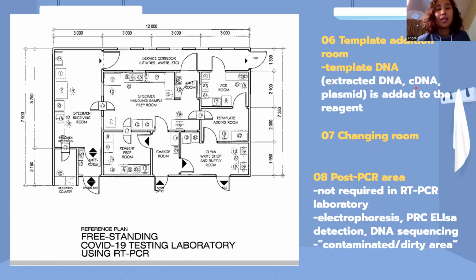Kunyari, guys, bear with me. Kung COVID-19, hindi ba RNA virus siya? I told you, your thermocycler, guys, does not photocopy or replicate, make copies of RNAs. So what we do is we convert it into complementary DNA. So your RNA is converted into a complementary DNA. So they serve as your template DNA. Naiintindihan? Okay? So ito yung kokopyahin ng paulit-ulit.